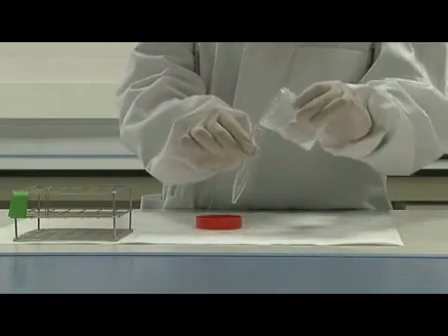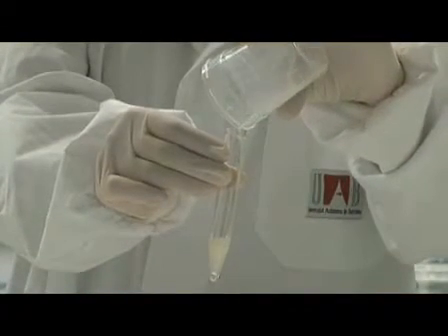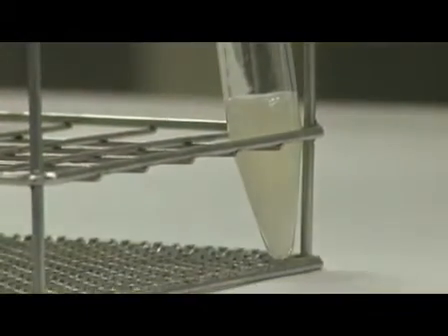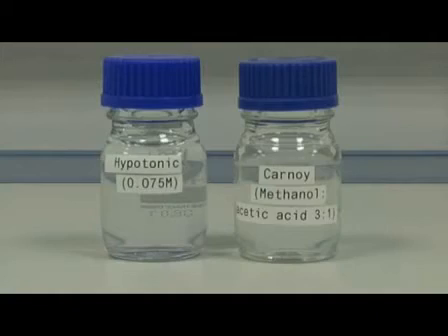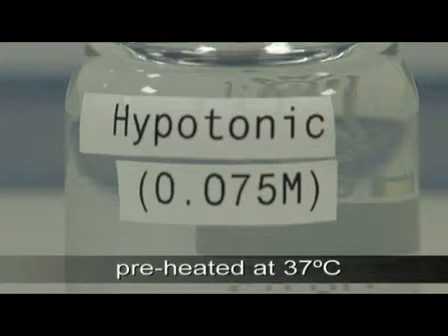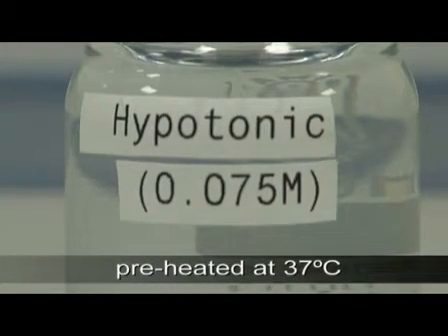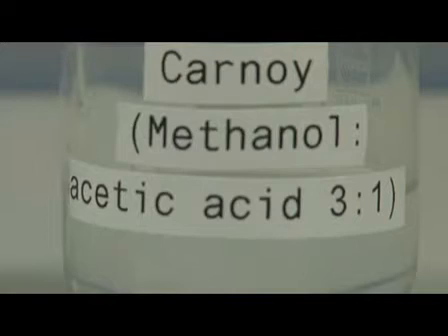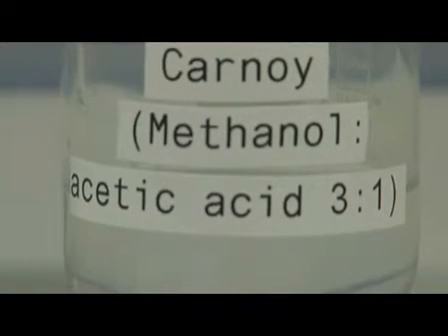To begin the protocol, the sample must be transferred to a centrifuge tube. The solutions we are going to use in the first part of the experiment are hypotonic, preheated at 37 degrees C and methanol acetic acid in the proportion of 3 to 1. These must be freshly prepared.